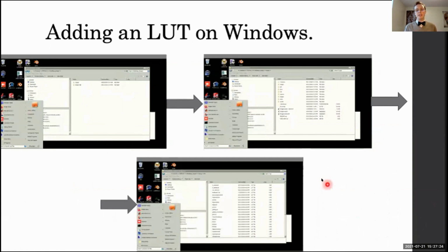All you have to do is find wherever you have saved Fiji on your computer, then open up the folder, go into the LUTs folder, and add a selfmade3 to it. Hopefully, after a few minutes, all of you will have a selfmade3 inside of your LUT folder in one way or another. So I'm going to give you a few more minutes to do that, and I'm going to give everyone a minute to restart ImageJ/Fiji so that we can automatically use it.